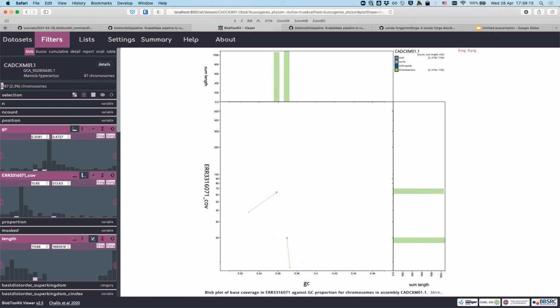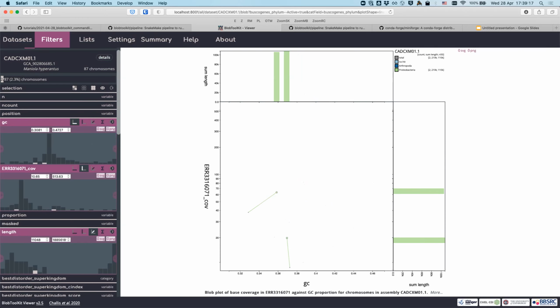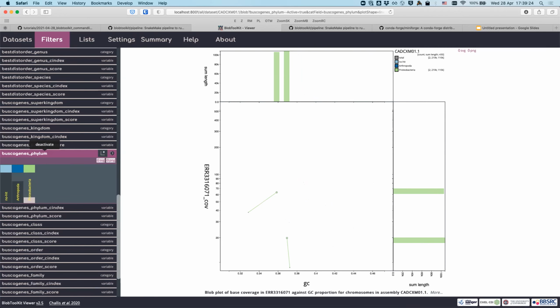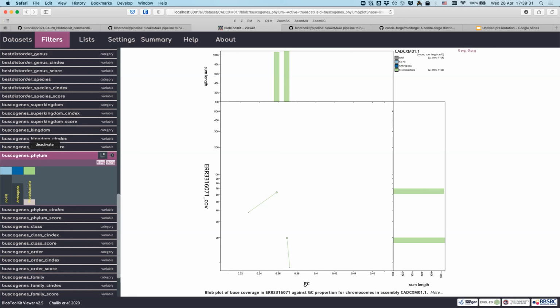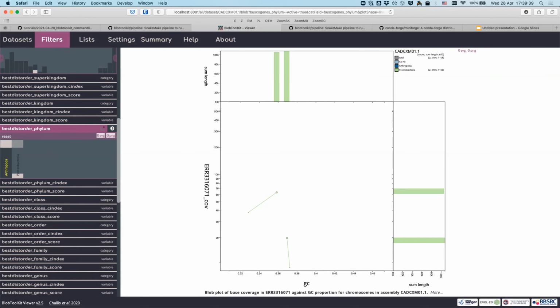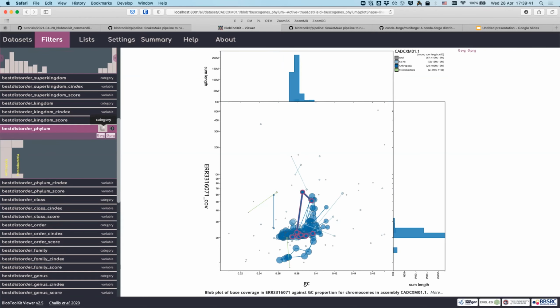Thank you. And this is specifically the BUSCO gene BLAST that I'm showing you. Wait, I've forgotten what I'm showing you. I'm showing you BUSCO genes phylum. So only the BUSCO genes which were found on these contigs have been BLASTed and assigned a value. But this little ball and stick thing works for all of them, not just the BUSCO. Yes, if I go back to here and say reset this and show me that as the categories, it's also highlighted that one contig that I picked out. Yeah, that's very cool. And you can go in and look at it.